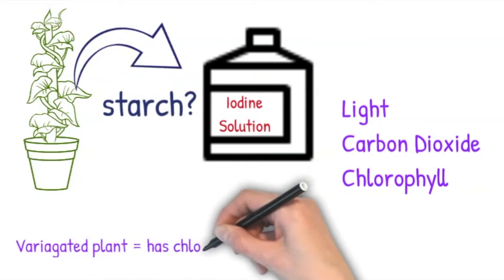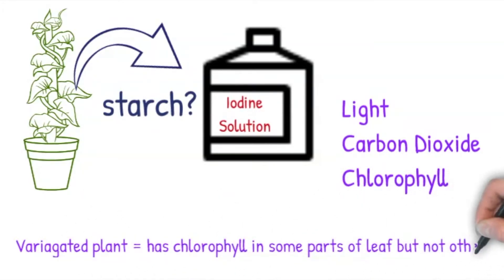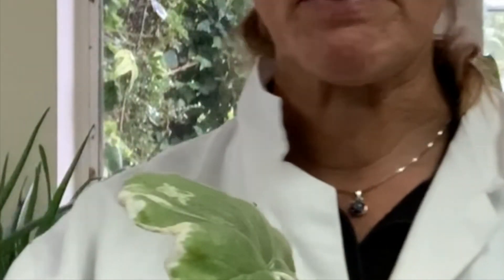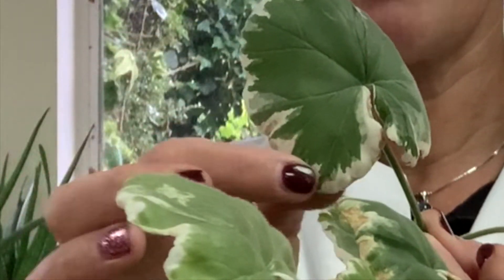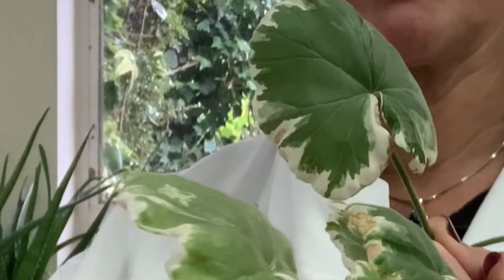In the practical today I'm going to test the leaf of a variegated plant for starch. A variegated plant has areas of the leaf which are green with chlorophyll, and white areas which have no chlorophyll in them.